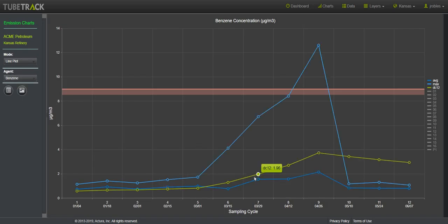This is important because when Eurofins or your laboratory uploads your results, we'll kick out notifications. If your delta C goes over this 9 micrograms per cubic meter, we're definitely going to kick you a notification. But if you want to be notified if you get values above a certain level, there's certain thresholds that you want to keep track of and be notified of. Once your lab reports are issued, we can definitely do that as well.